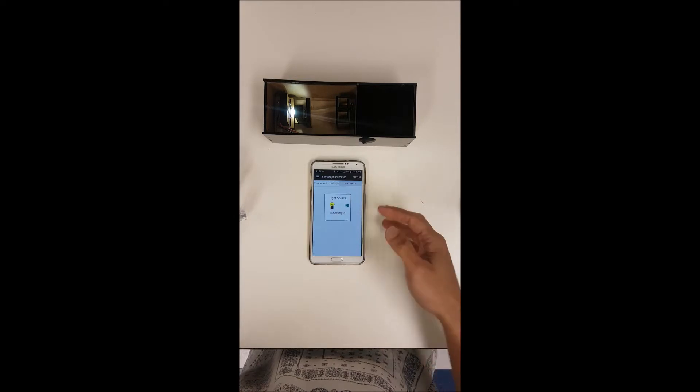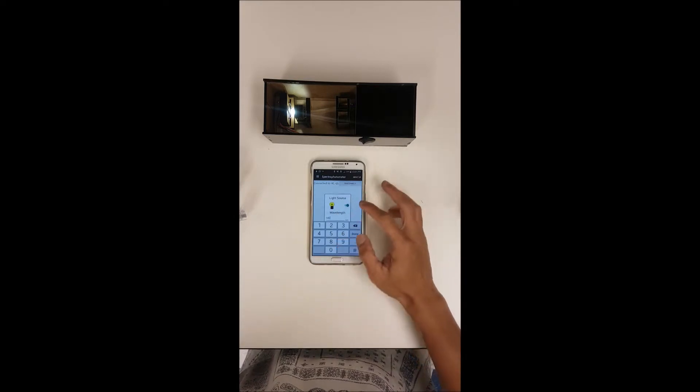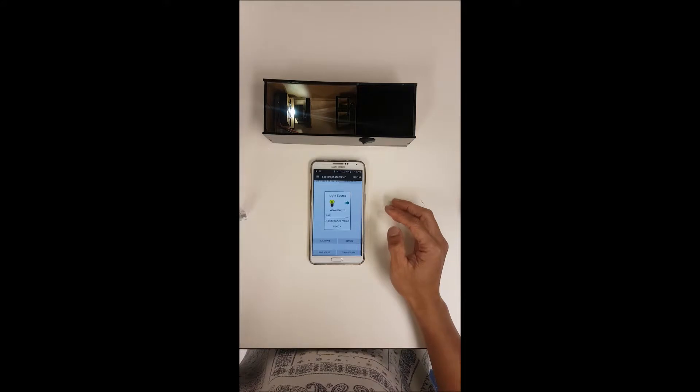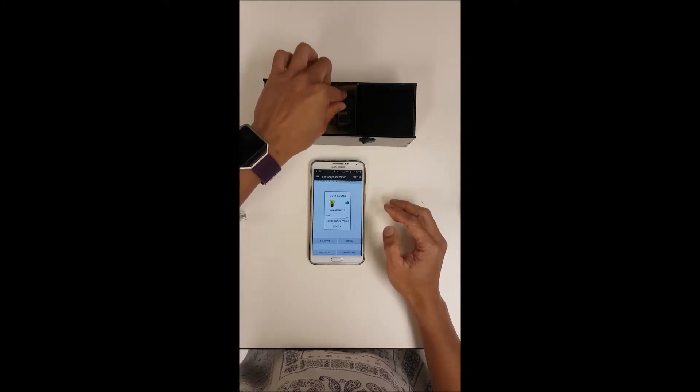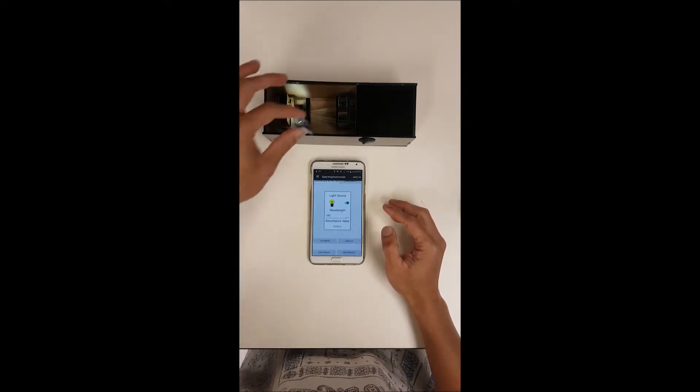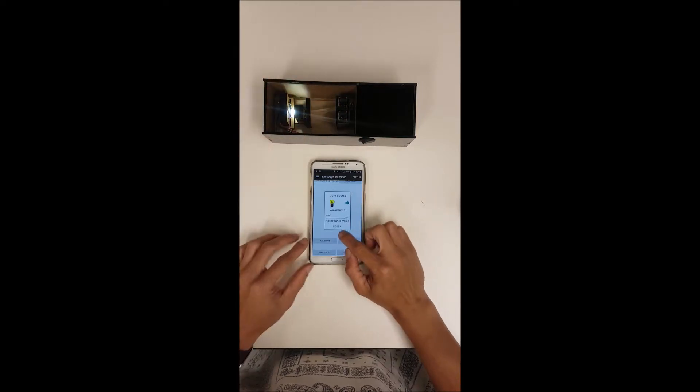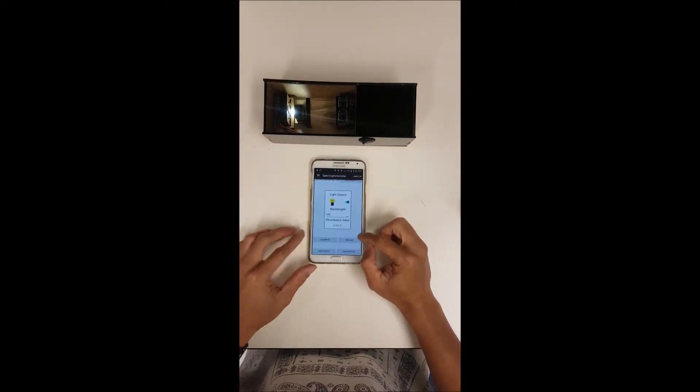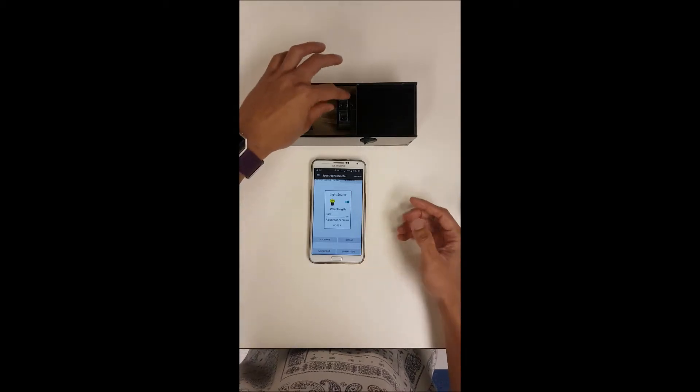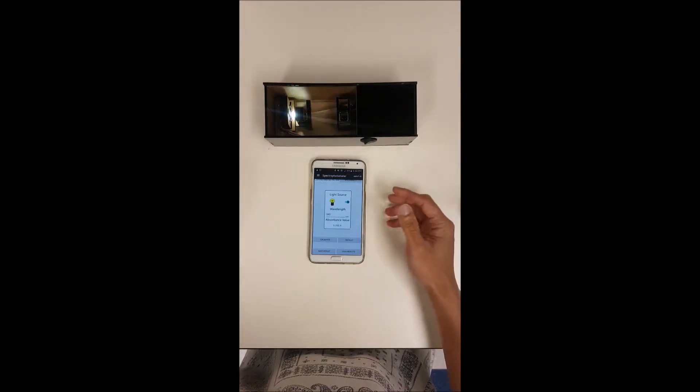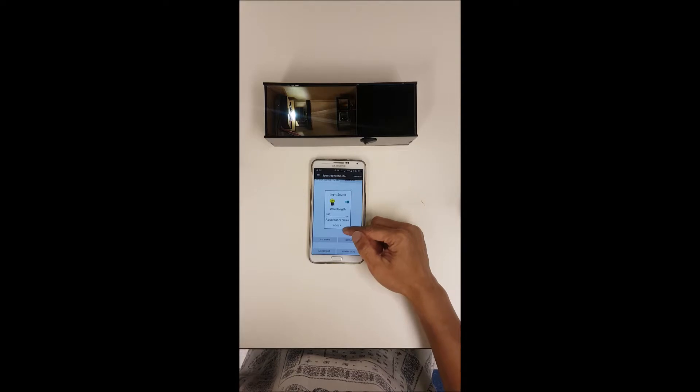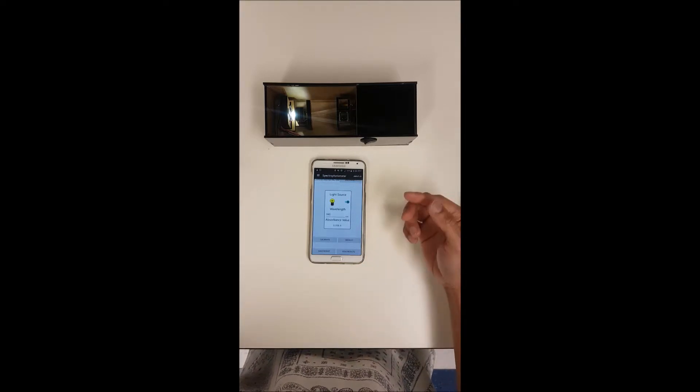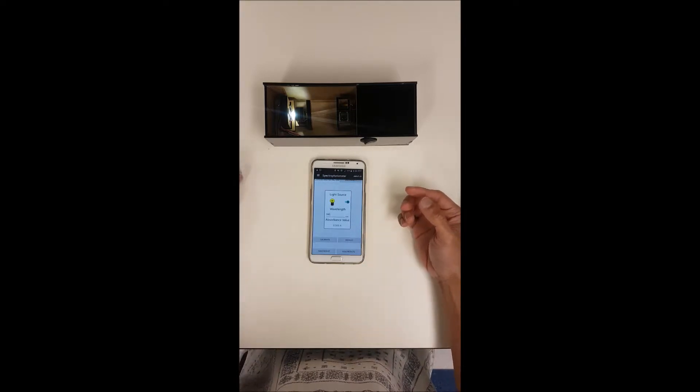Having it on, we will choose for Bradford 595 nanometer wavelength and you put in the blank on the top and the sample at the bottom and you can see immediately you have a deducted reading. Pressing default goes back to the original setting without any cuvettes in and you can see that without the cuvette in it's around 0.5 absorbance.